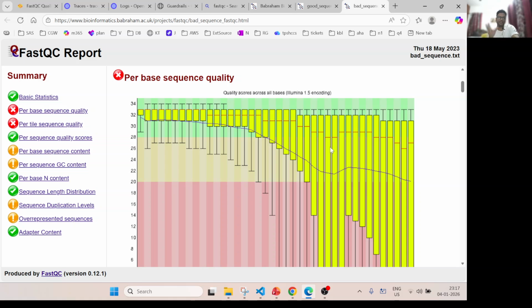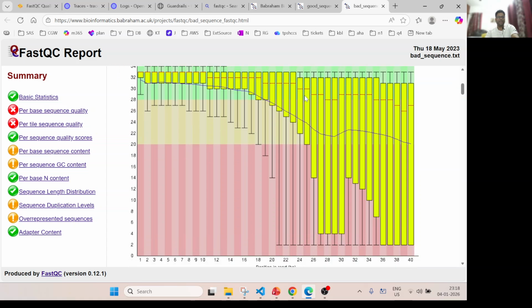This is just a hypothetical example. Let's say we will have an agent. We just need to provide the agent the FastQ file. The agent will run the FastQC tool locally in your system, get the output, and then parse this text file behind the scene. You can use an image model to do that, but that is very costly.